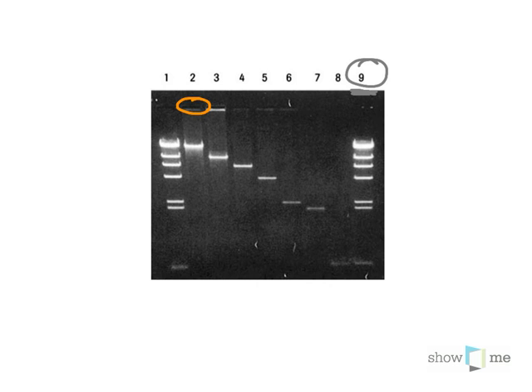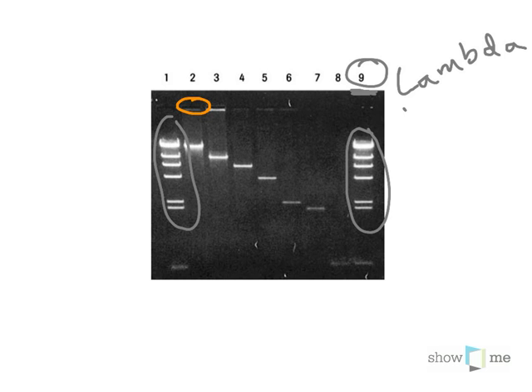So this control loaded in lane 1 and loaded in lane 9 is lambda DNA digested with the enzyme HindIII. Basically, when you start at the beginning of that lane and you measure from that point to the leading edge of each band, that distance you'll plot versus base pairs. For each band, you always go back to the start and measure down to the leading edge of the next band, and so forth. You keep measuring every single one.